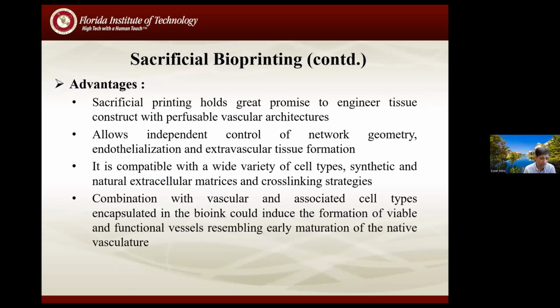The key I want to emphasize is vascularization. You're going to see a lot of papers able to print, but are they able to maintain the perfusion for an extended period of time? That's going to be a key. The other important thing is to make sure that whatever you're printing is not just very specific. You're going to try various tissues, like a brain tissue we're working on. I'll show you that at the end. And cell types, different types of extracellular matrix, so different combinations. It's sort of a permutation and combination. What may give you the right structure?